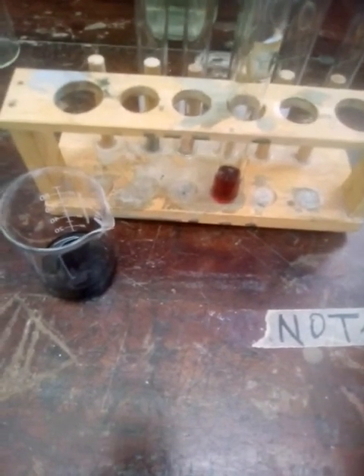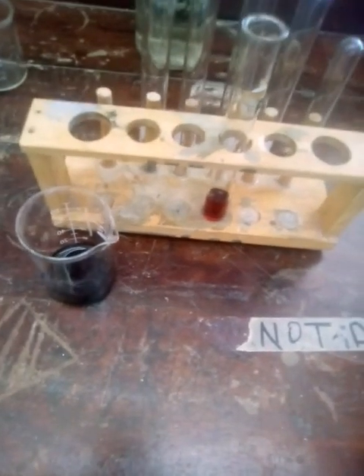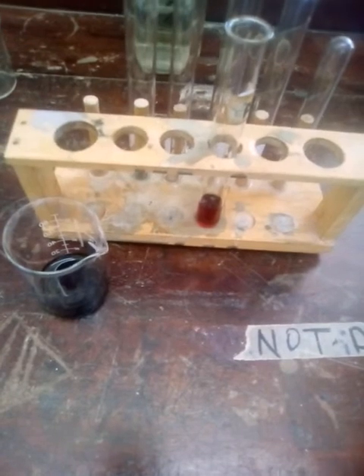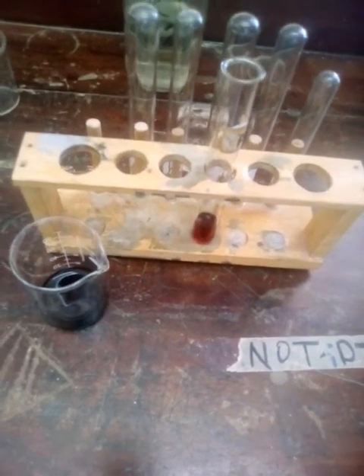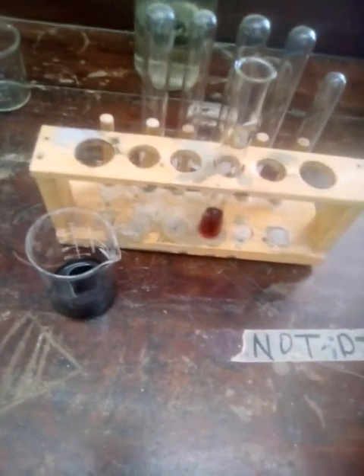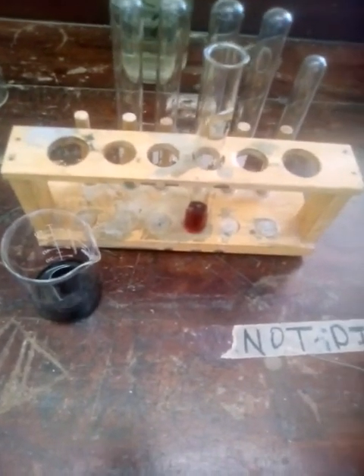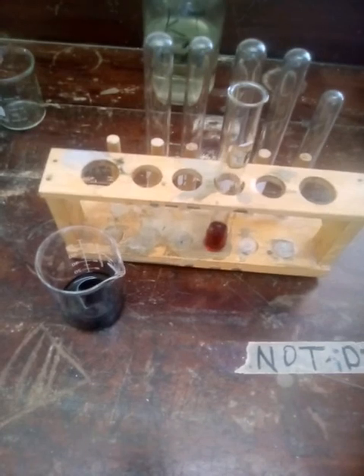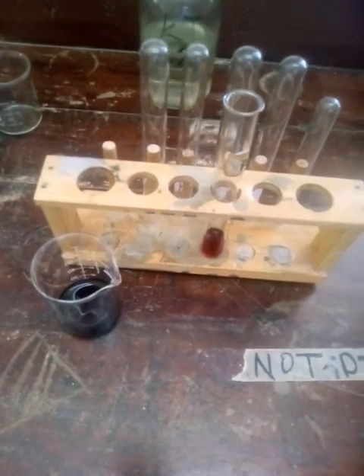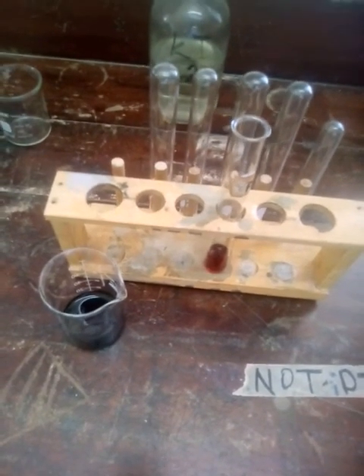I'm not going to tell you which reagent was the oxidizing agent and which one was the reducing agent, but when you write your chemical equations, the oxidation reaction and the reduction reaction, you will be able to see which was which. Thank you very much. Hopefully we all learned something today again.